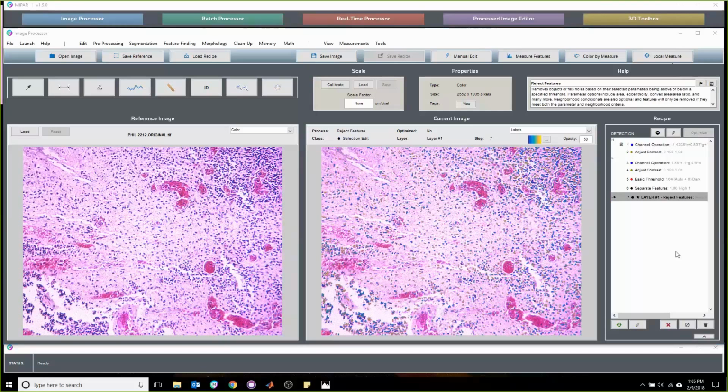Based on what you've traced, we take those intensities and put them into some code that is pretty simple to create and is based off of a paper that's out there that we'd be happy to share, and I think it's even shared through our user manual in the channel operations section. Potentially, I'll check on that. We take those intensities from the recipe, put them into the code, and that spits out the channel operation that you see listed here, which, as Paul just showed, is quite powerful.